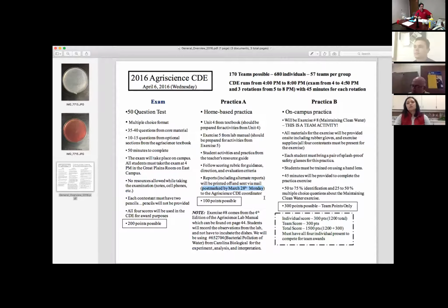If there are no more questions about that, where I want to spend the most time today is on Practicum B. That is the practicum that the students are going to do as a team here at UNL the day they're here. This year, since we are on natural resources, this practicum involves counting bacteria that come from local water sources. And it's kind of a cool, fun, exciting thing.